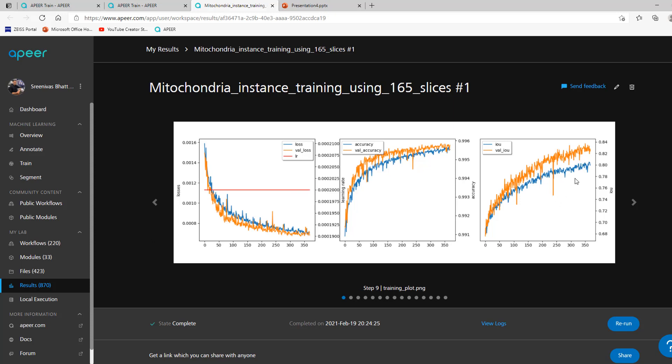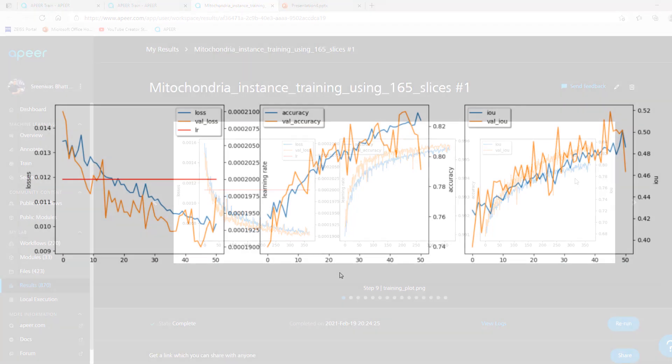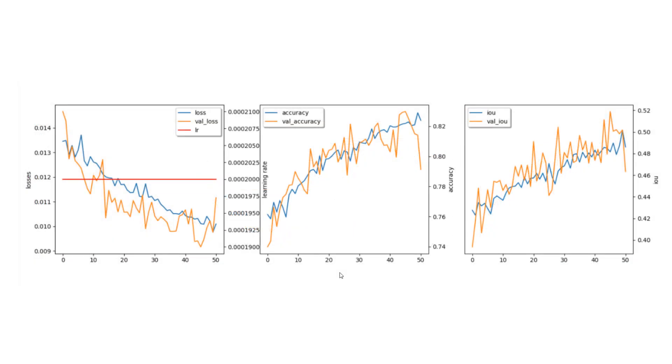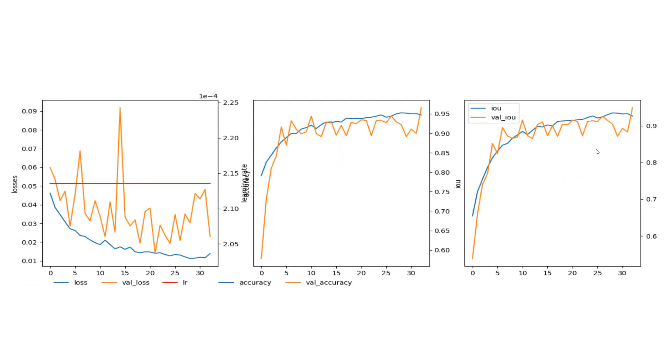Now let's have a quick look at a few training curves. Here is how your training curves may look. In this example, both training and validation curves are close in all the plots, and this is highly acceptable.